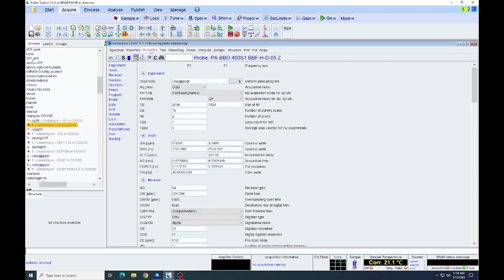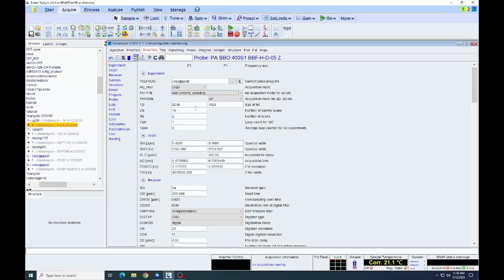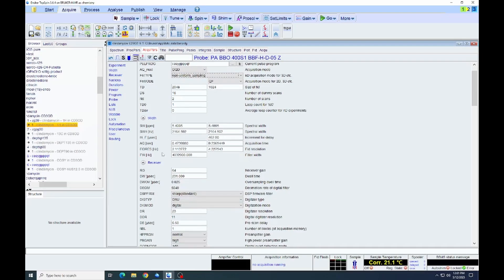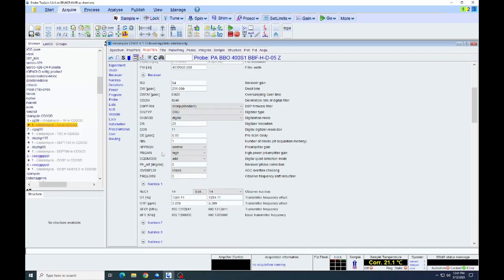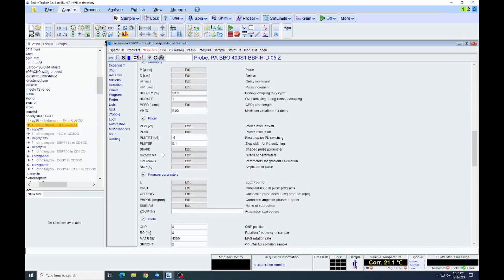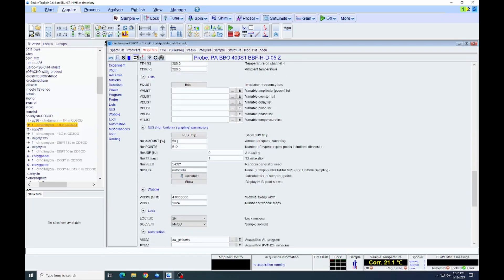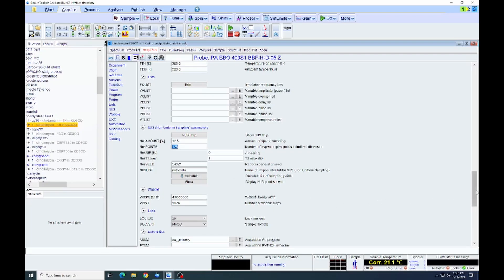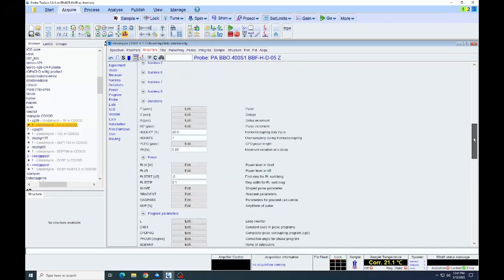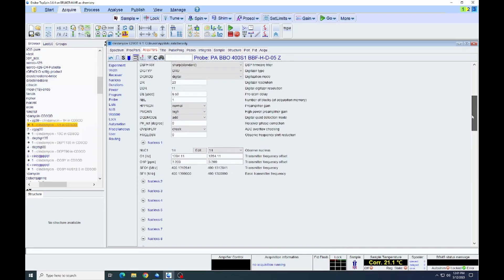Now, if we go back to the acquisition parameters, we can see that it's changed the window. One thing we do need to do is change the FN type to non-uniform sampling. Now we're going to scroll down to the NUS parameters and set that. The percentage we're going to set to 12 and a half. So we're going to only acquire one eighth of those 1024 increments that we set earlier. And you can see then we're actually acquiring just 128 actual increments in the indirect dimension rather than all 1024.